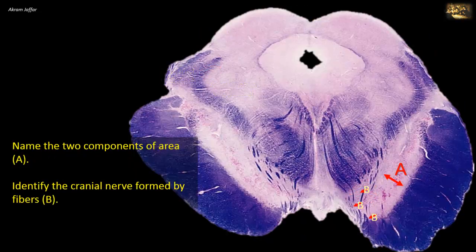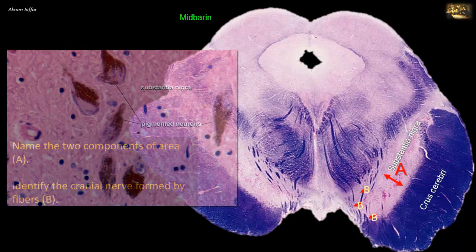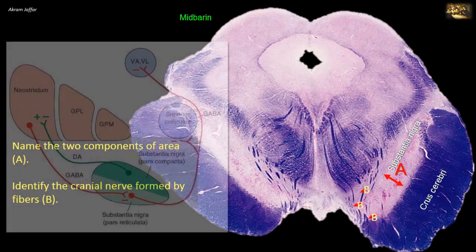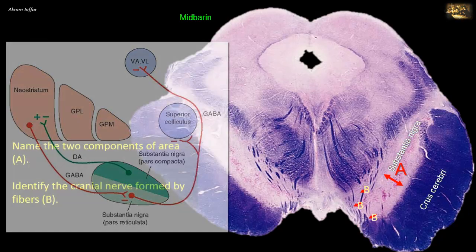Name the two components of area A. This is a section of the midbrain showing the cerebral peduncle comprising the crus cerebrae — the darkly stained fibers — and the substantia nigra. Substantia nigra is area A. It is a motor nucleus that consists of two regions: pars compacta, the compact zone, and pars reticularis, the reticular zone. The compact zone is made up of distinctly pigmented neurons, while the reticularis contains non-pigmented neurons. The substantia nigra is reciprocally connected to the corpus striatum, and its neurons undergo degeneration in Parkinson's disease.